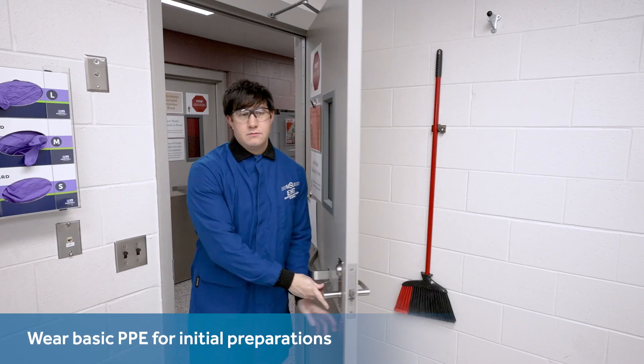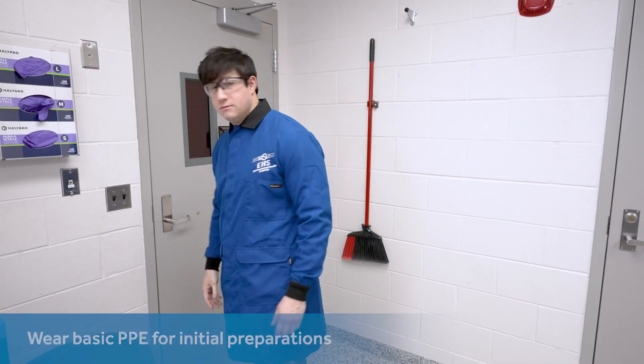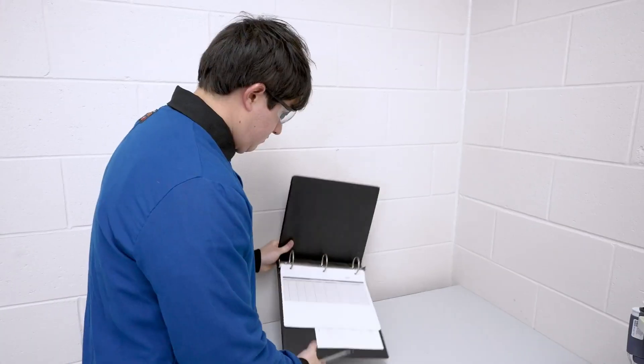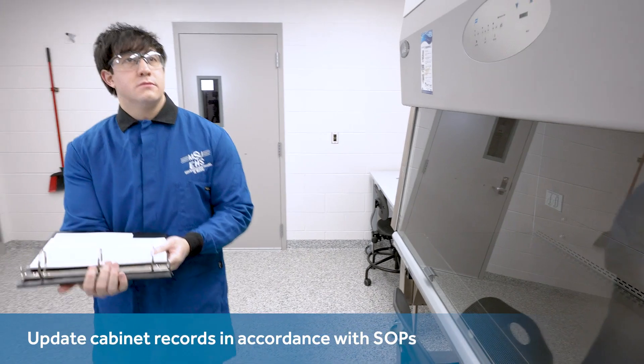As you perform the first steps to get ready before manipulating any biohazards, wear a traditional laboratory coat over relaxed attire. Create a record of the cabinet's use according to your laboratory's standard operating procedures.